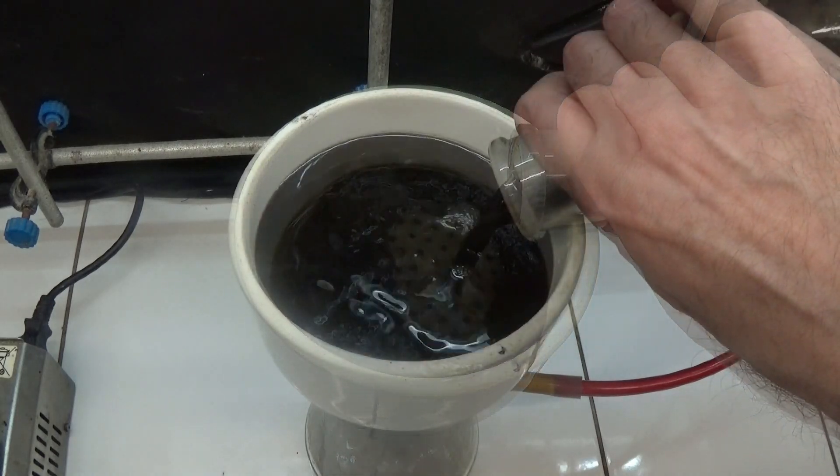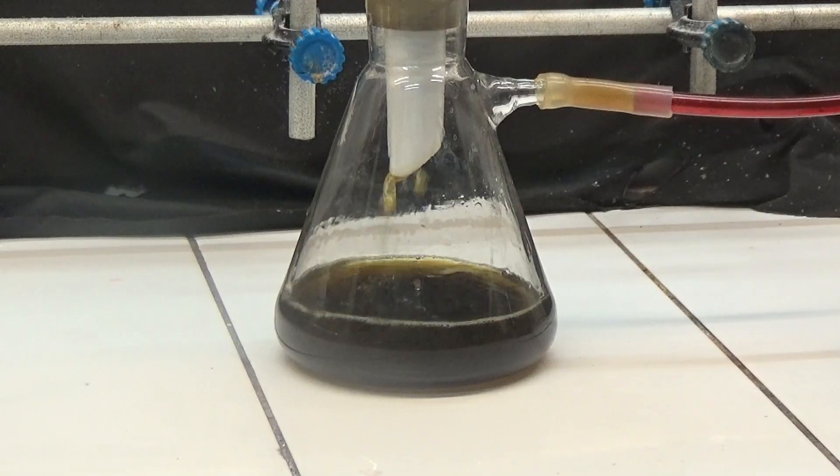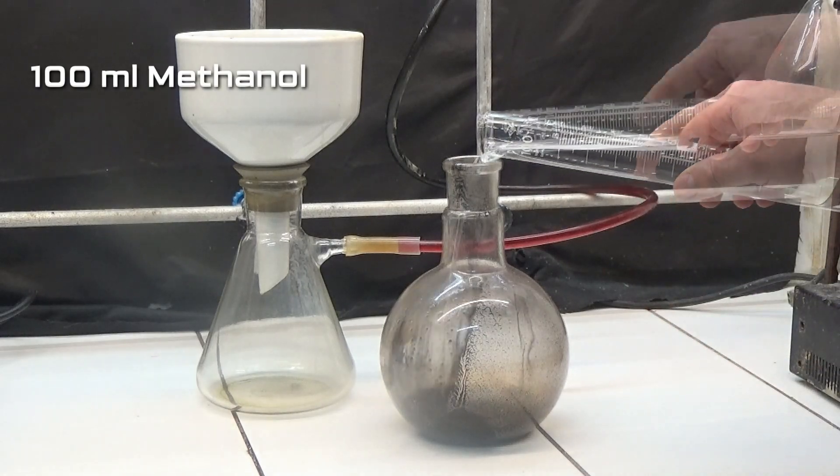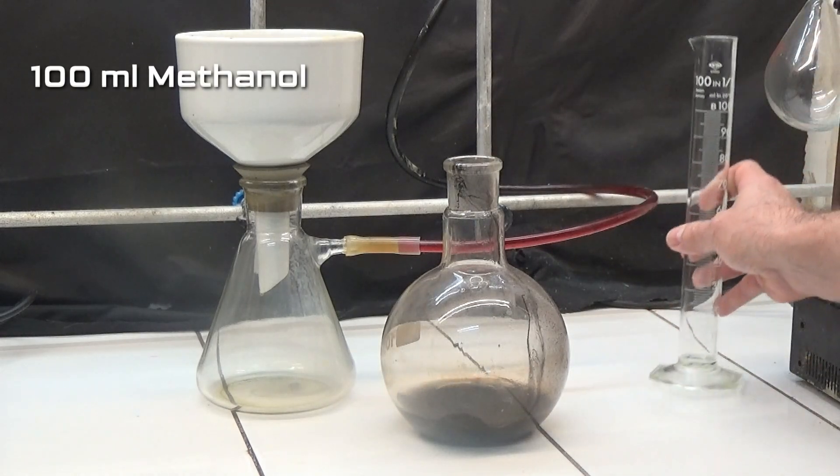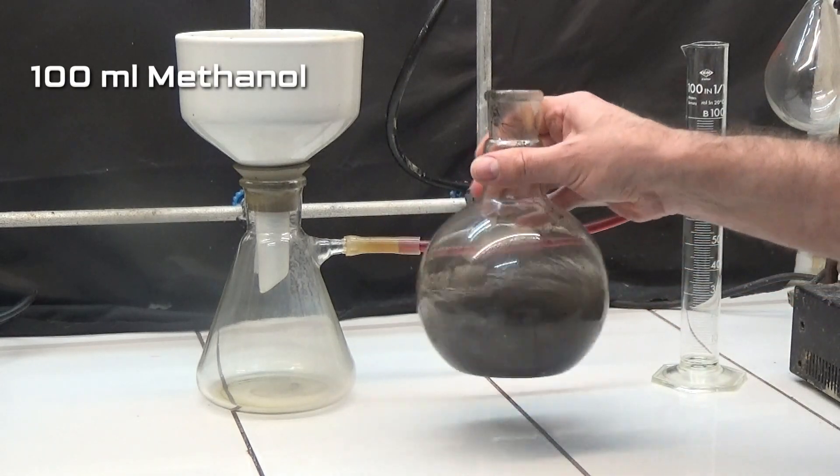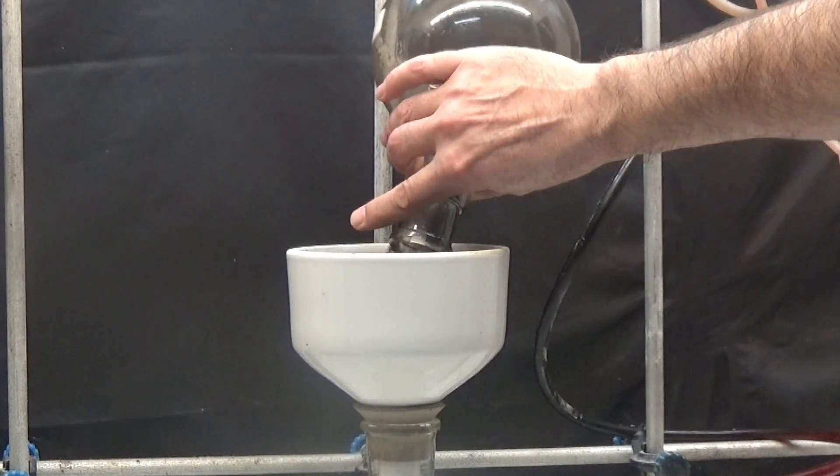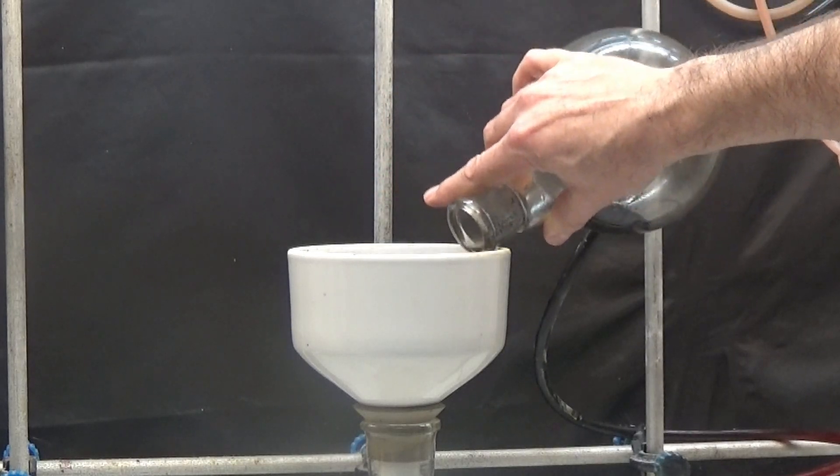Allow to cool and filter through a Buchner funnel with filter paper. Wash the retained precipitate with 100 milliliters of methanol. Keep the precipitate moist. The iron is pyrophoric and can ignite spontaneously.